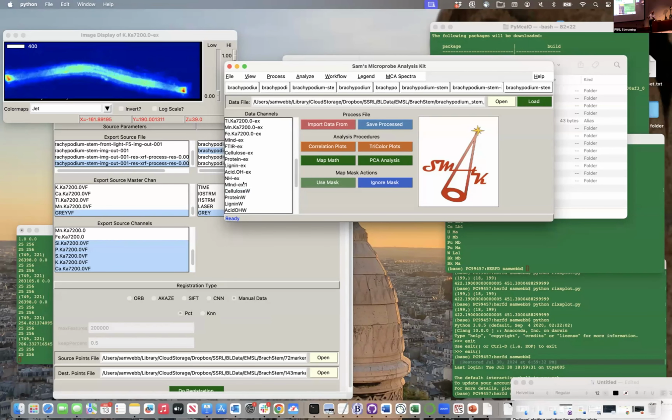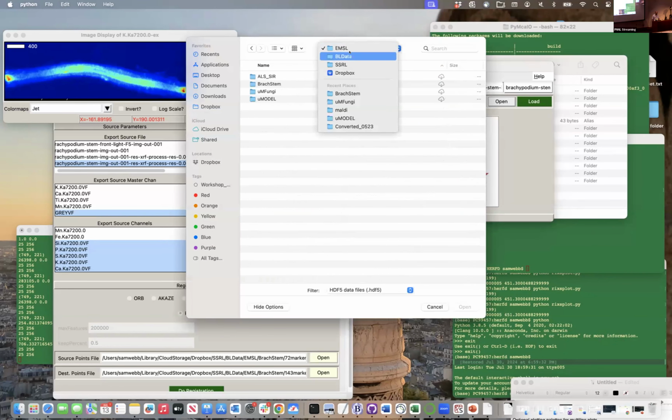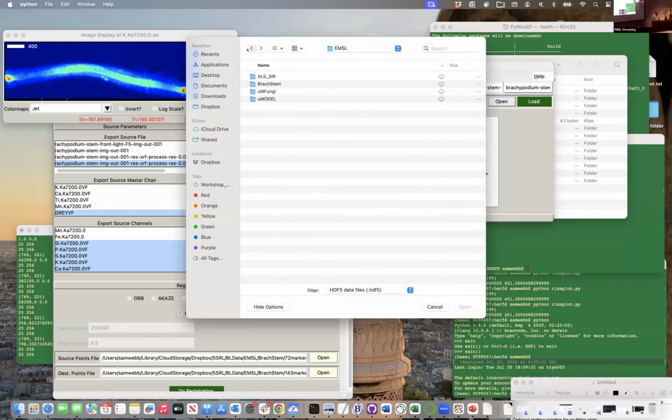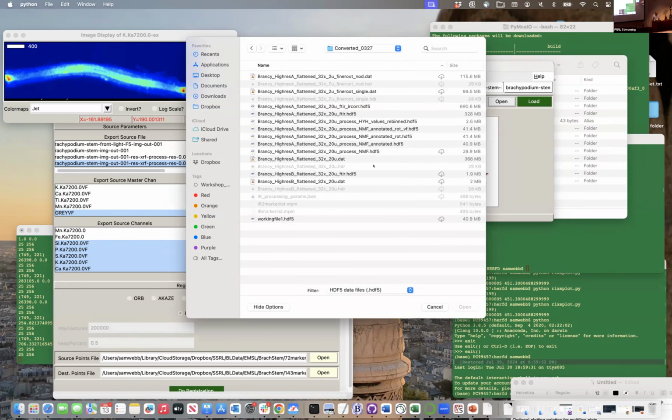So I'm going to save a little bit of time and say we did those same steps that I just did manually on the infrared data and pulled it in. Okay. When we go to the infrared data, I will open that data set directly for just one second to show you how easy it is to do. Like, don't go backwards repeatedly. So here's our ALS data.